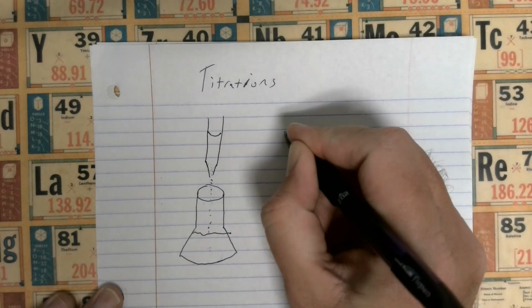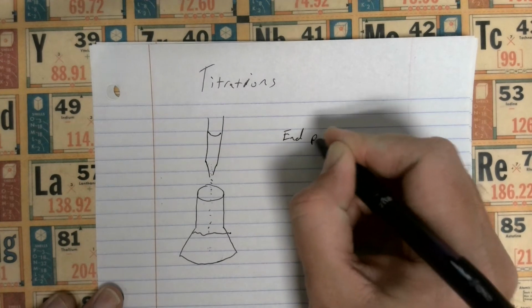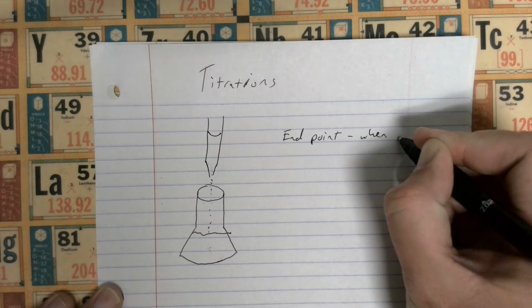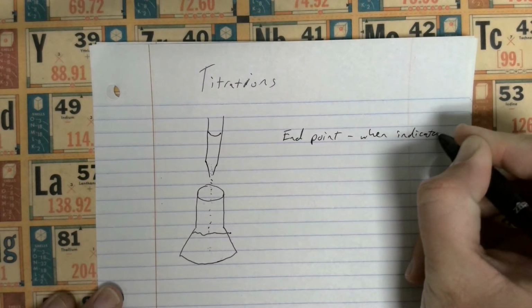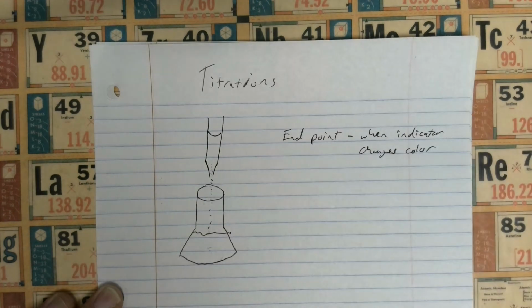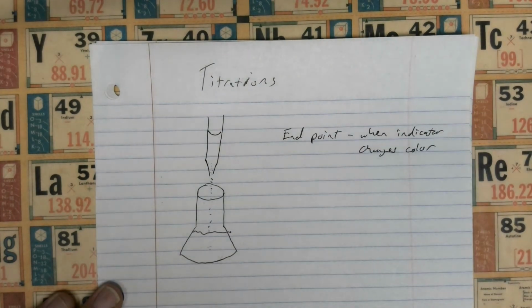So the end point of a titration is when the indicator changes color. One of the most common ones is phenolphthalein, and it turns pink in the presence of a base, but it's clear in the presence of an acid.